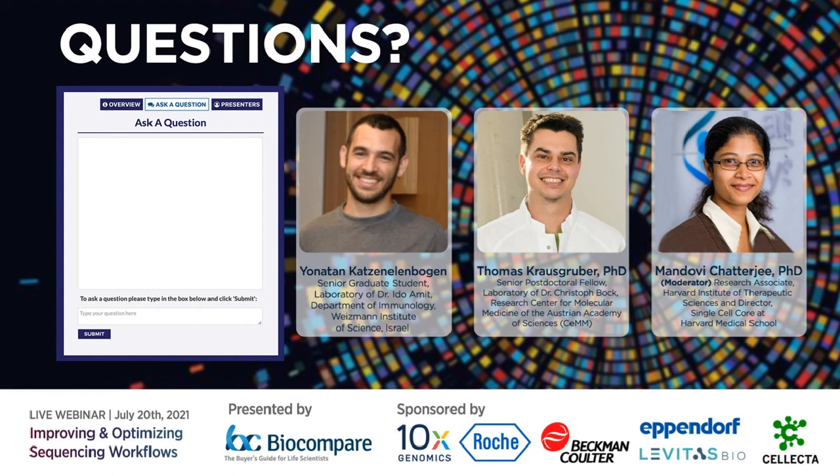I agree. But sometimes we have a scleroderma paper coming up in a few months. We needed to hunt down a really rare population, which we almost couldn't detect with RNA without something like 10 or 12 fluorophores. It was almost impossible. But I agree with the general notion of taking a broader gate. I think it's an important issue.